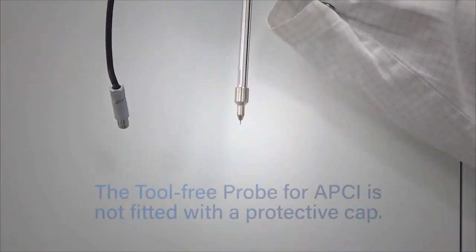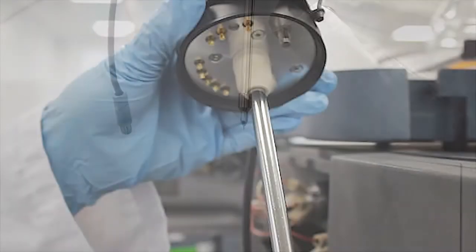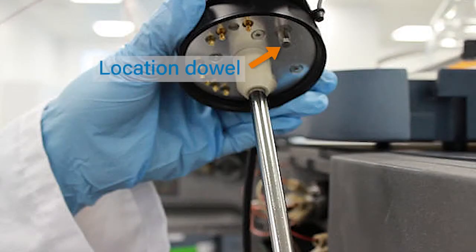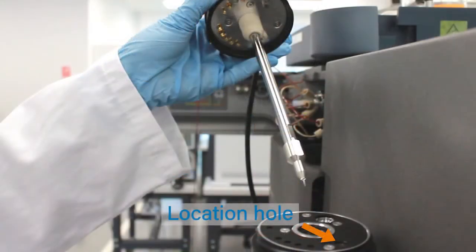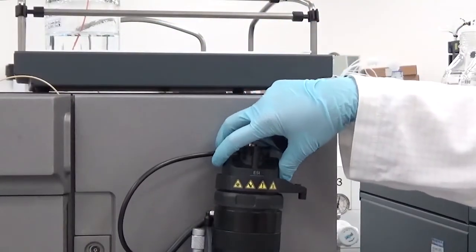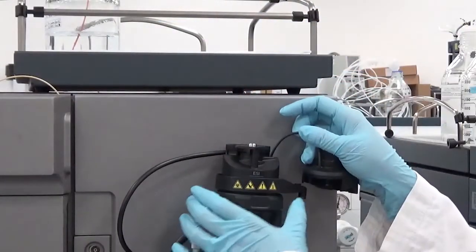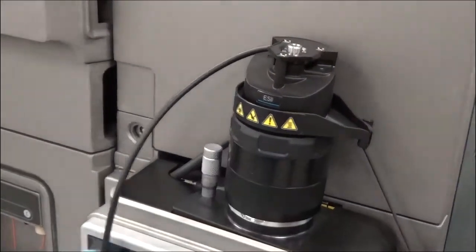Note that the tool-free APCI probe is not fitted with a protective cap. Align the probe location dowel on the probe adapter with the location hole in the probe adjuster. Slide the probe adapter into the probe adjuster. Turn the locking ring clockwise to tighten the probe adapter to the probe adjuster.